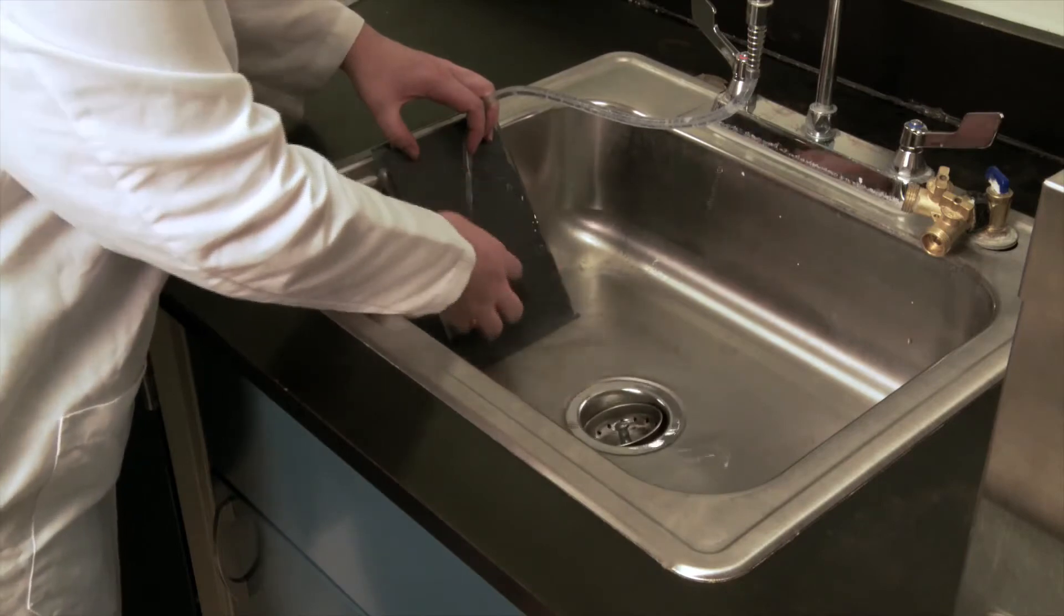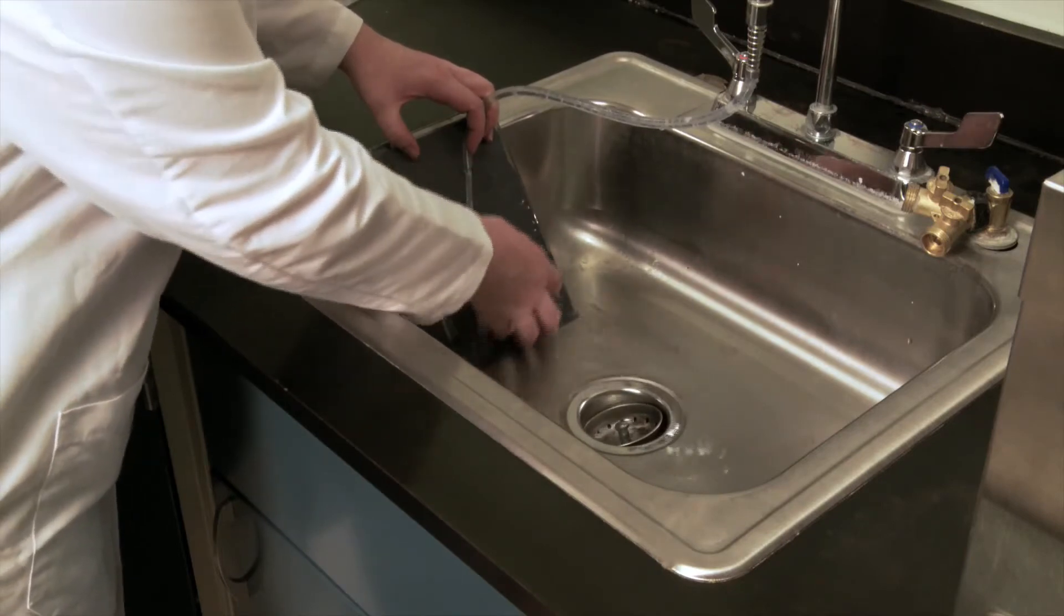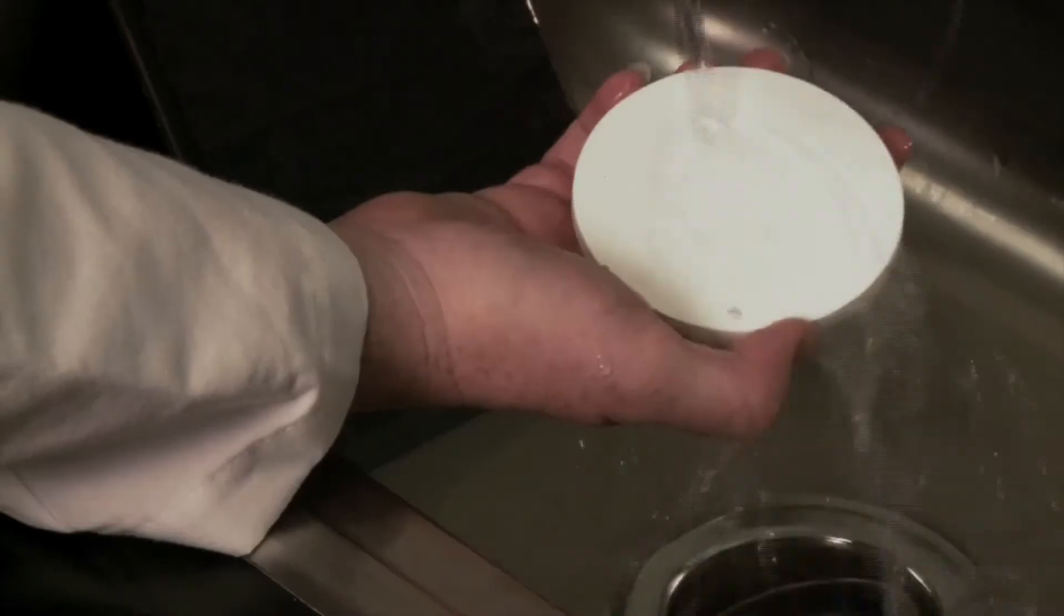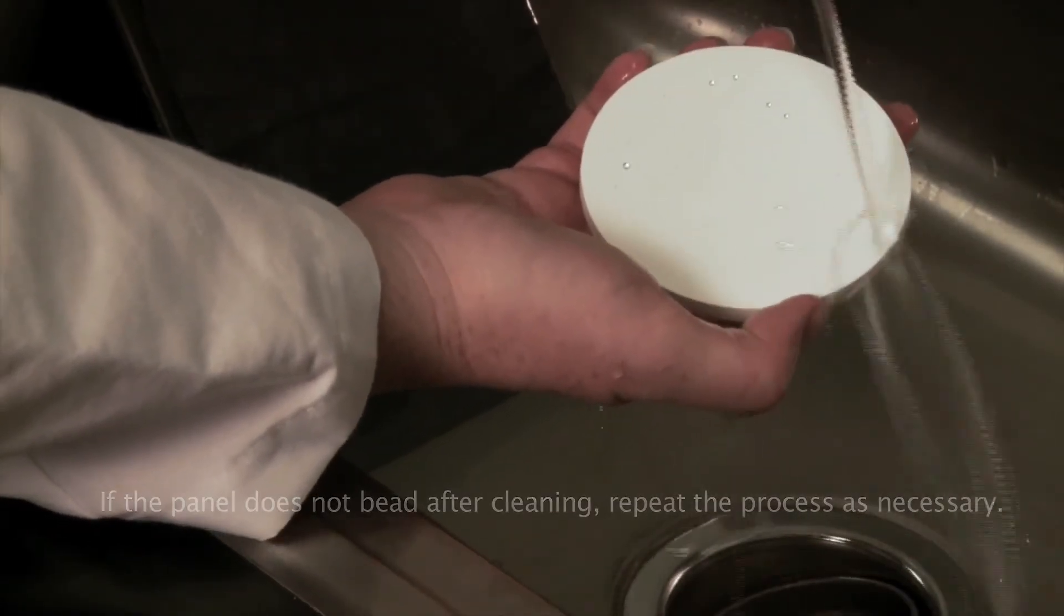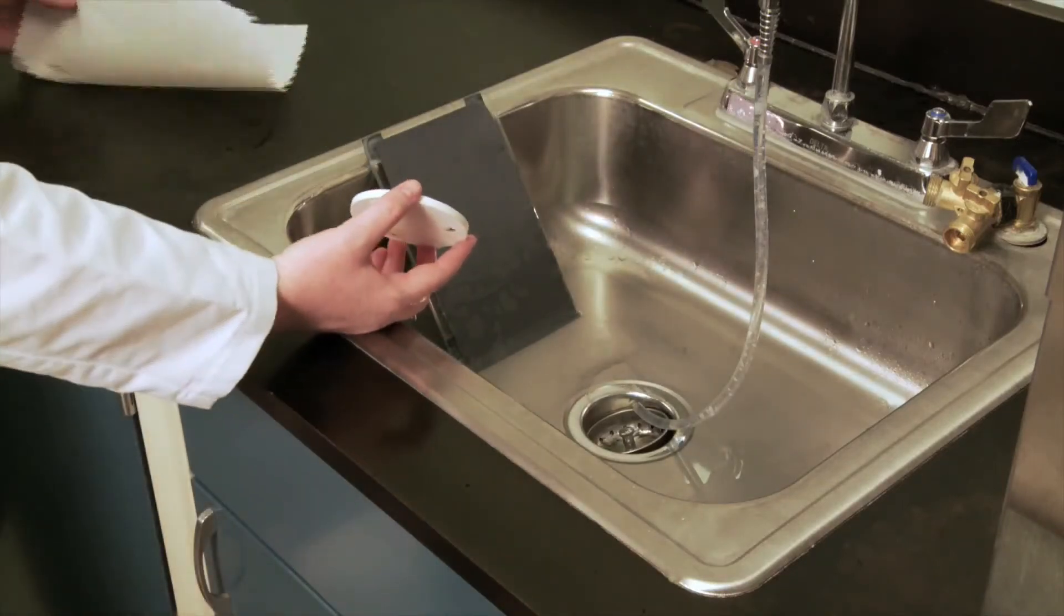When a Spectralon panel is clean, the surface should be hydrophobic. Check to make sure it is clean by running it under the flowing water and look for areas where the water saturates the panel instead of beading up and running off.